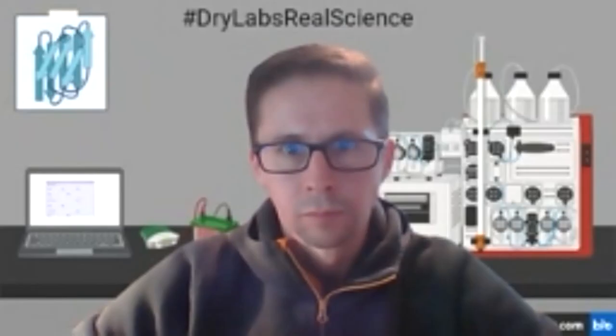The HPLC simulator was done completely remote. Any sort of interactions that I did were usually, you know, we use Blackboard, and so I would hop on the Blackboard chat, and they knew that they could get in touch with me if they needed some real-time feedback. But for the most part, students just worked on it on their own. The earlier iterations with the GC simulator, we would schedule some time in the computer lab, and the students would work on it either together or with immediate guidance from a TA or something.